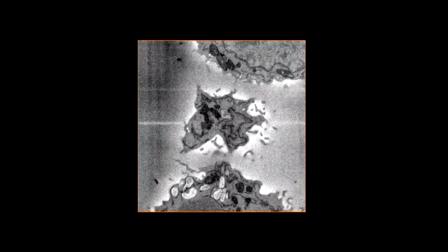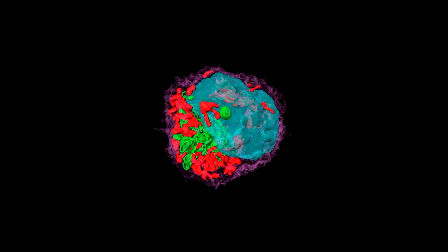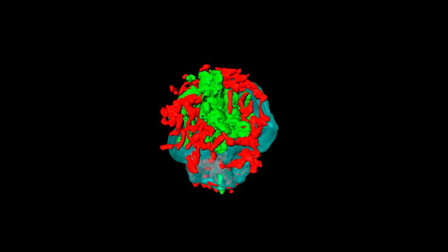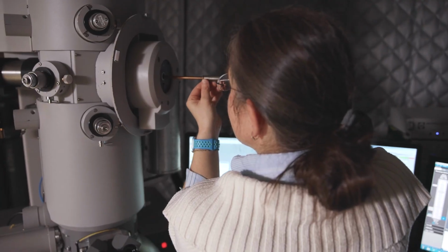We found that these lysosomes were surrounded by the mitochondria at one pole of the cell, and the whole exchange of the iron is going from the lysosomes to the mitochondria where heme is produced. And basically it was just a beautiful study of structure-function relationship, which you need to do in 3 dimensions because you can't tell what happens in 2D.